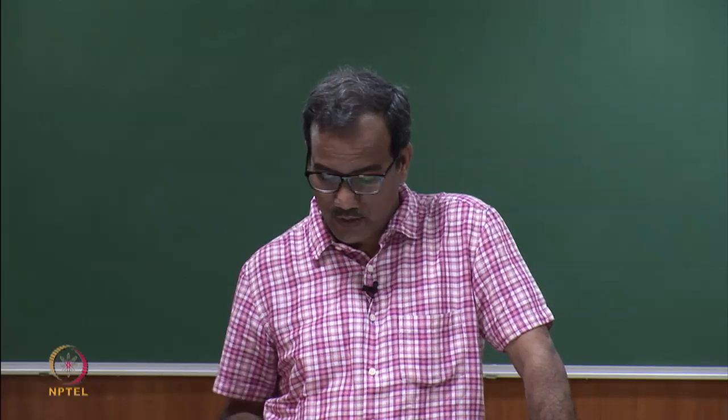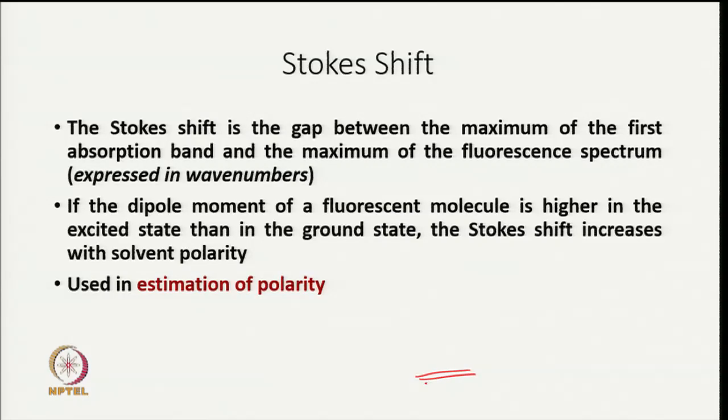Just to remind you, what happens in fluorescence spectroscopy is when a fluorophore absorbs the radiation, it goes from the S0 ground state to the S1 excited state and it can go to any of the vibrational levels on absorption of light.